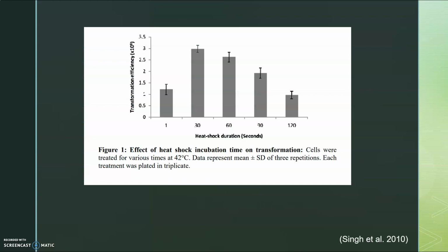We determined our hypothesis mainly off this graph from the first article because, as you can see, the 30-second heat shock has a higher transformation efficiency than the 90-second.